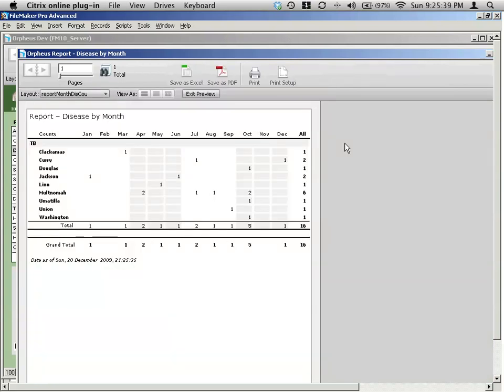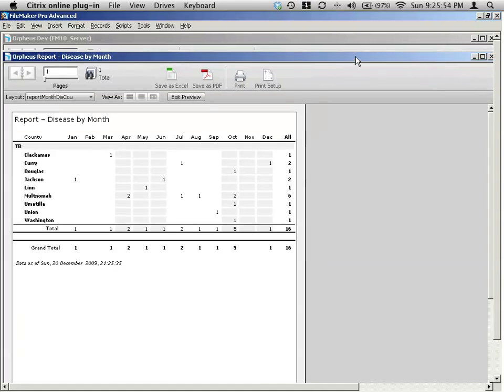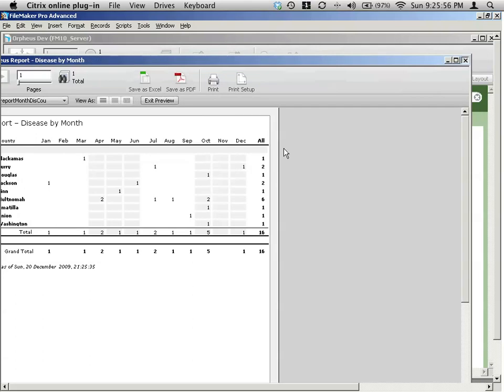And pretty much everything in the report module is super fast because it's de-identified. The table that you're searching on is actually a copy of the regular case table. It's updated every night, and it searches really fast because it doesn't have any of the patient names in it.